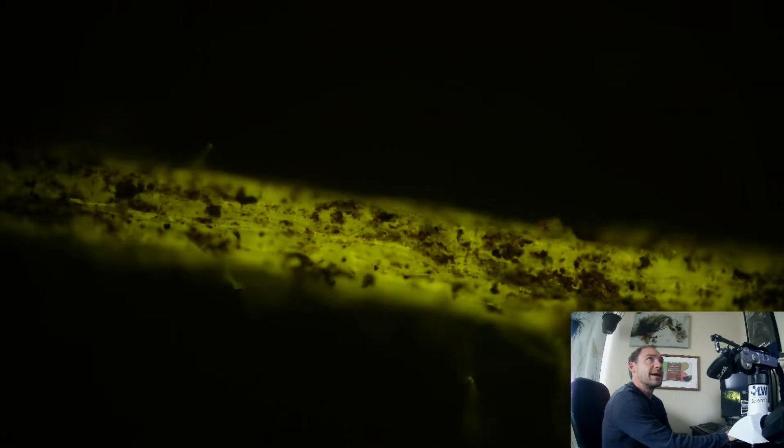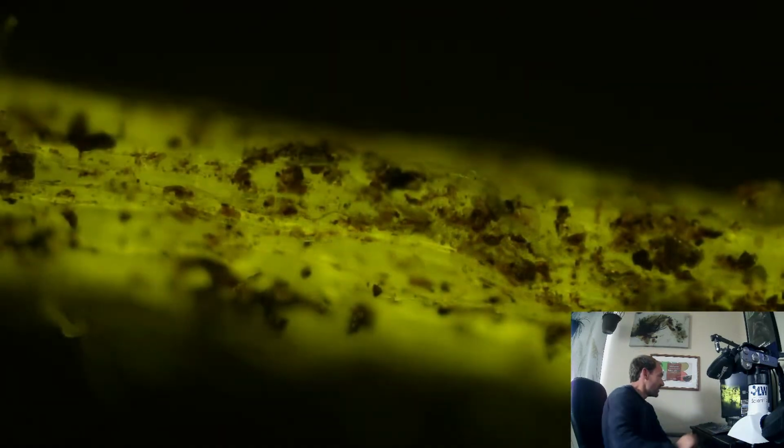Right here. That looks like fungi. Small, but where'd my pointer go? There you are, pointer. Right here. It's definitely inside, and it's not following the shape of the cell walls. And it's definitely endophytic fungi growing inside of the plant roots. So we'll go back out. We'll stay in 2x.